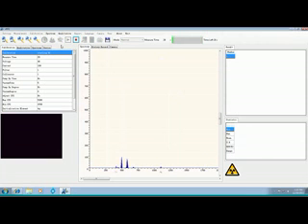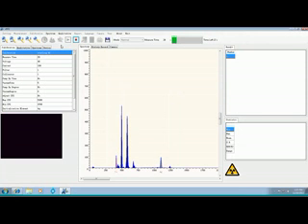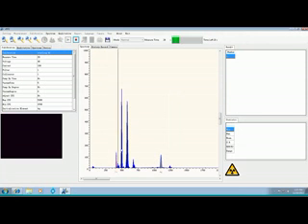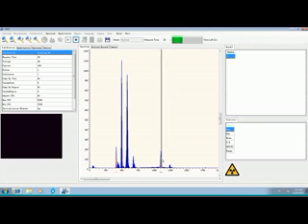Now at this point, the machine's going to count down for 30 seconds and it's going to make a spectrum and it'll automatically choose the right program to use and then give us a reading at the end of it.